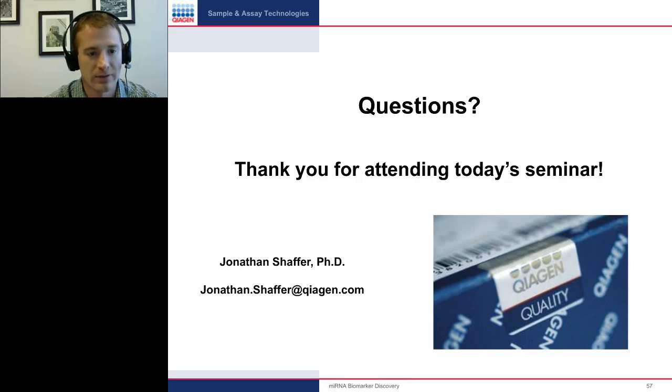Sure, we have a question. Is there literature available for the comparison and normalization that you mentioned? So yes, I can provide you with this. Simply write down my email, jonathan.shaffer@qiagen.com, and I can point you to a particular paper from the group that was involved with the MIQE guidelines. And these are methods of normalization that are recommended by this group.